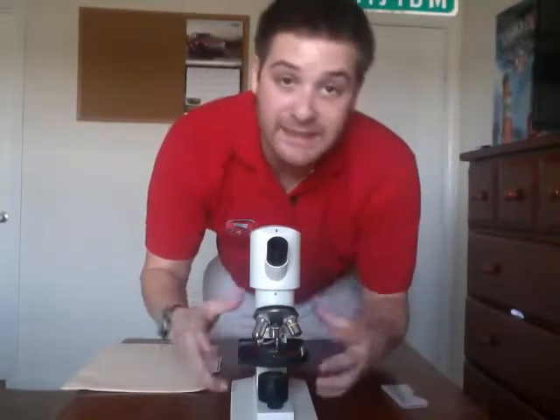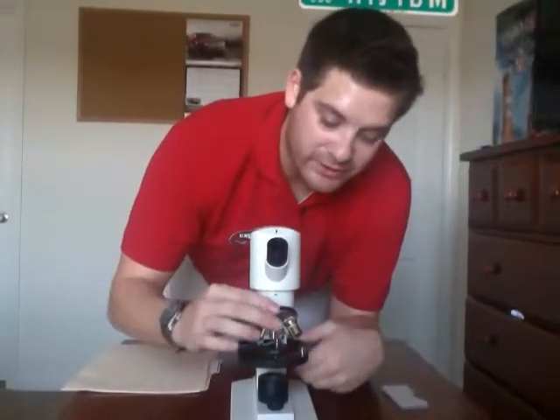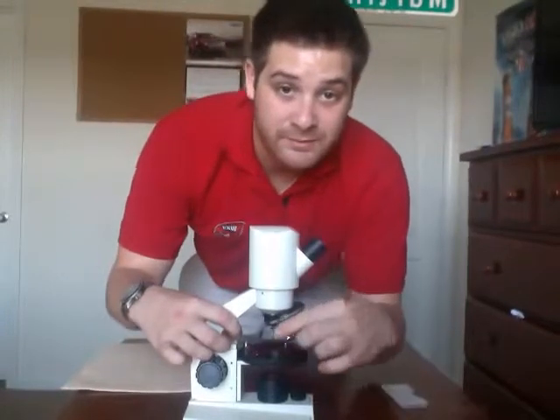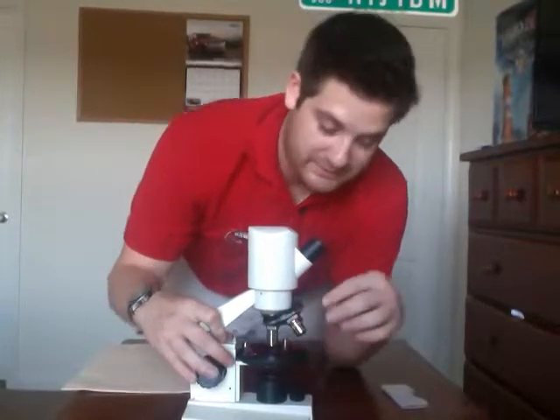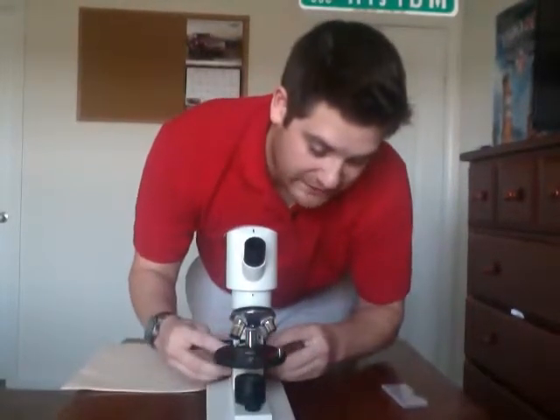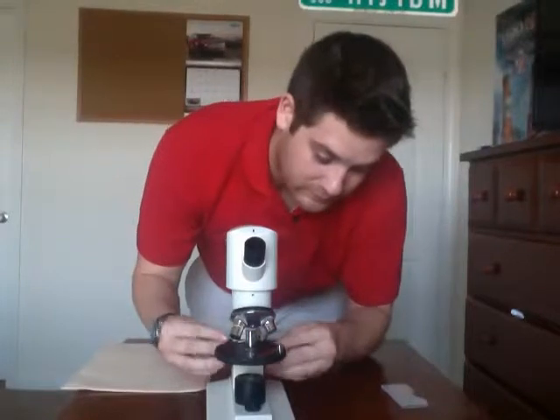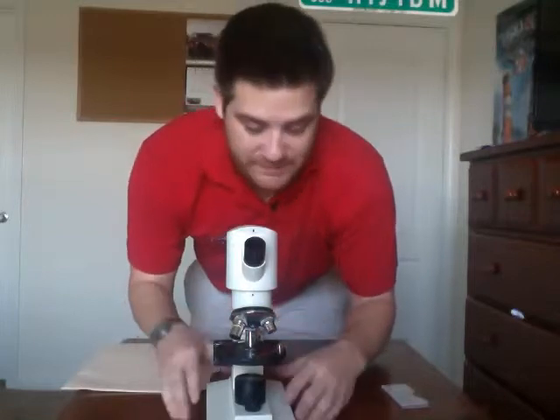And once your microscope is clean and you're done with your experiment, you want to make sure your objective lens, which I explained earlier, is on the lowest objective lens, which would be this one right here, the shortest one. And using your adjustment knobs, you want to make sure that it's at the lowest point it can be, which is like that. It's not touching the glass, but that way nothing will bend or break. It's secure and firm.